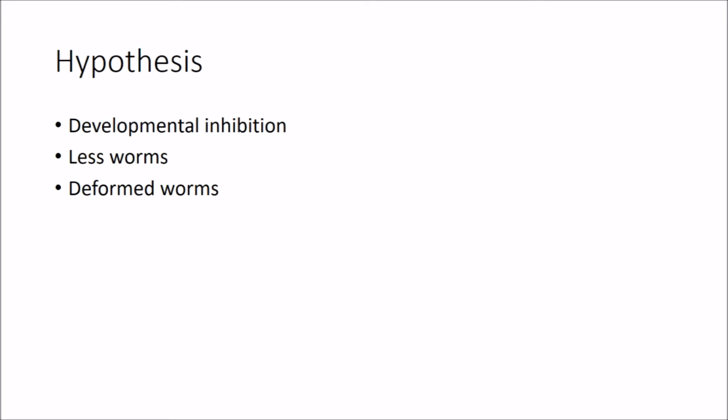My hypothesis was that worms would not be able to develop correctly, which would lead to less worms or deformed worms.